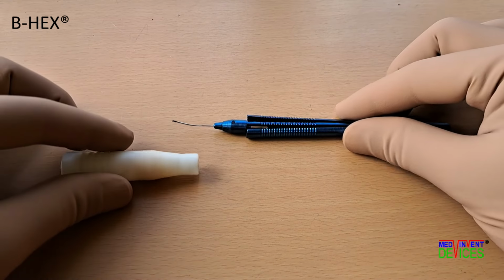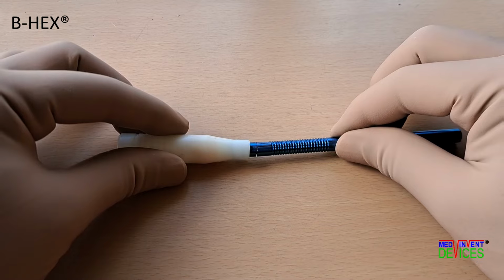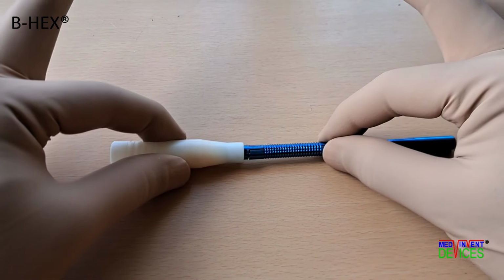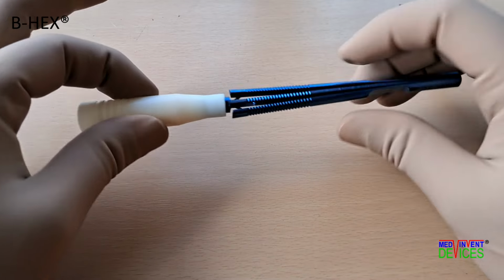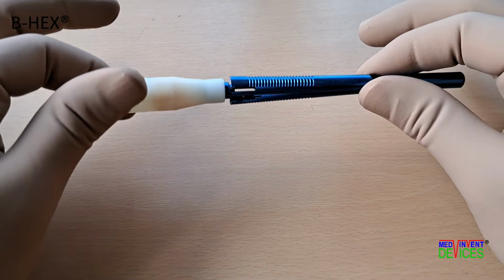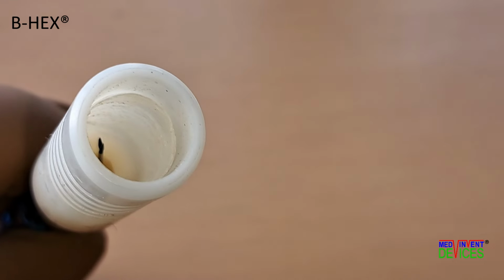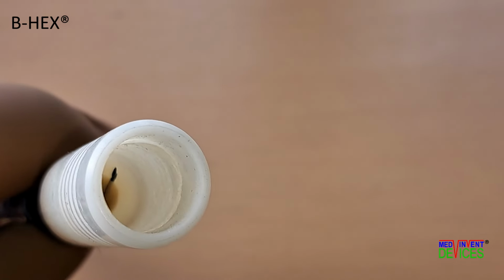Also, after a few autoclaves, the narrow end of the Teflon cap shrinks slightly, and then does not slide over the squeeze arms. Though the cap now fits tightly, capping and uncapping is a struggle. Once again, the jaws remain open and can get damaged.